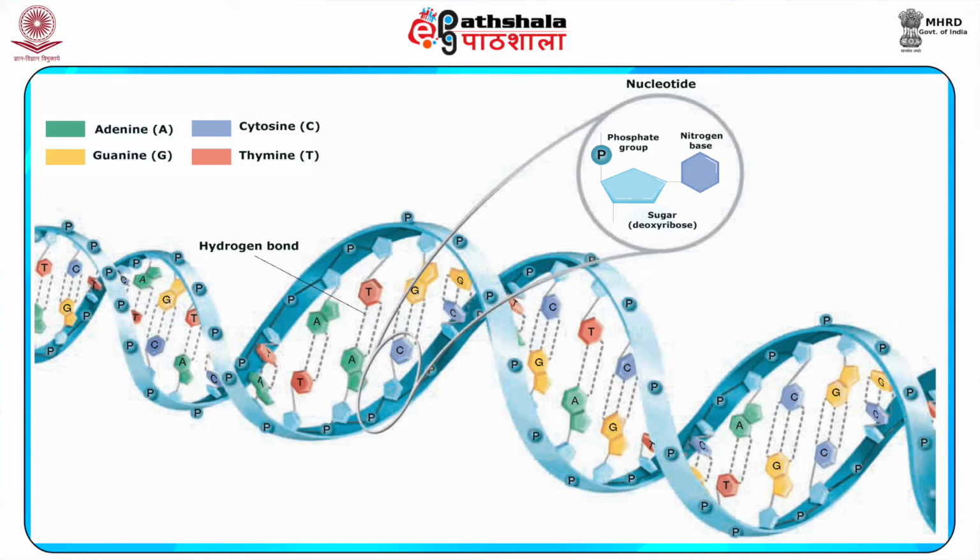The order of these bases A, T, G, C along DNA contains the complete set of instructions that make the genetic inheritance. Defining the arrangement of these nucleotide bases ATGC in a DNA strand is a primary step in assessing regulatory sequences, coding and non-coding regions.